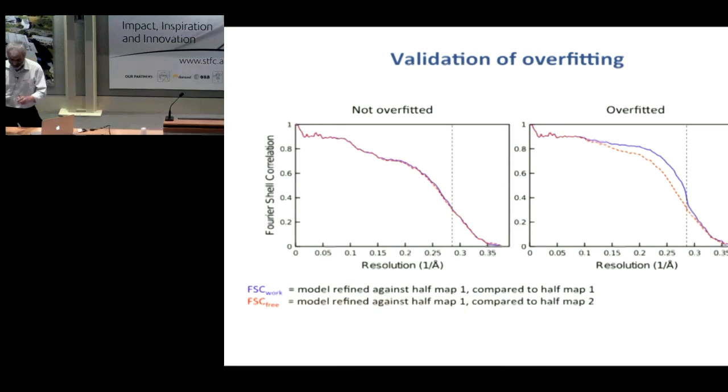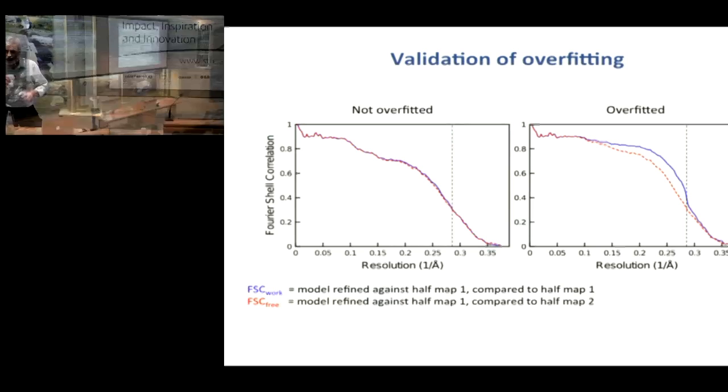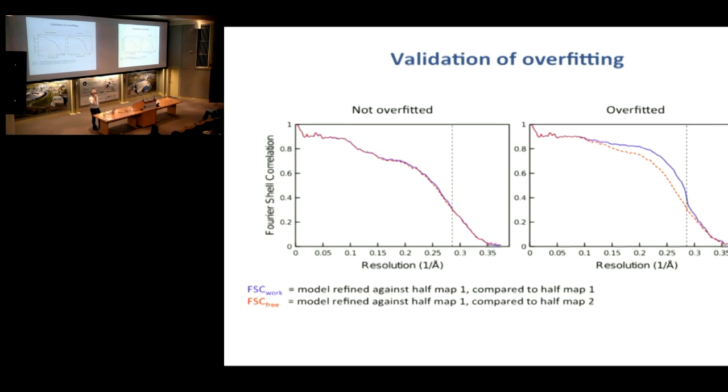I just have a quick question. You're splitting the data in half, so you're refining half the data to make a model and keeping half of it to test. We're normally running out of data, so do you know if it would be better to make a map from three-quarters of the data and keep a quarter as the statistical test, or is there proof that half is optimal? My view is that the tool that I would recommend is not available yet, even on paper.